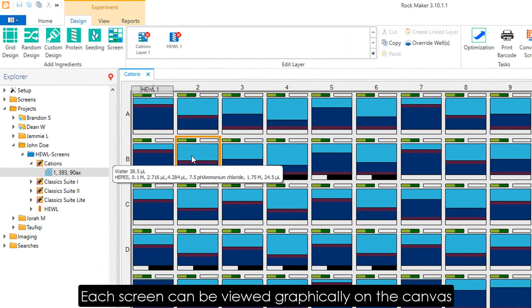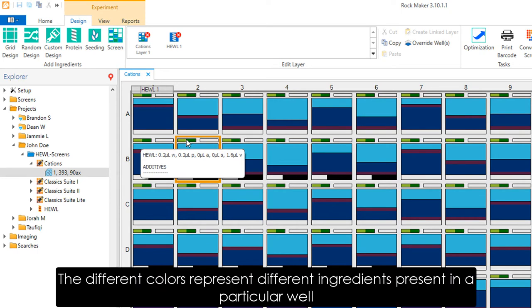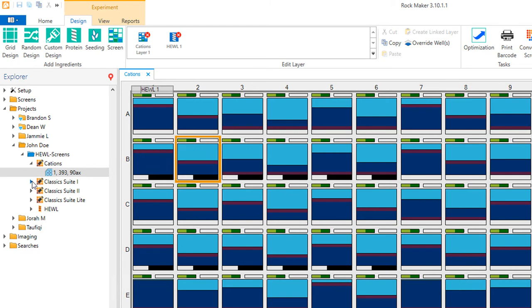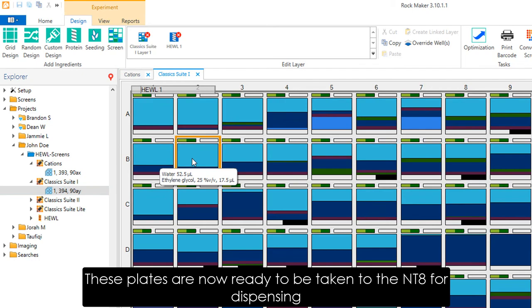Each screen can be viewed graphically on the canvas. Here the different colors represent the different ingredients found in each well. Now our plates are ready to be taken to the NT8 for dispense.